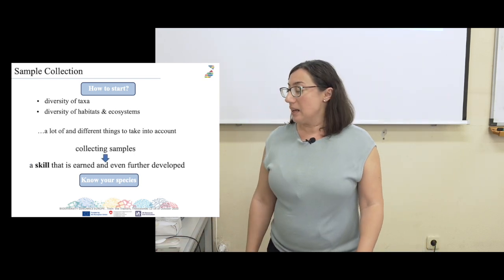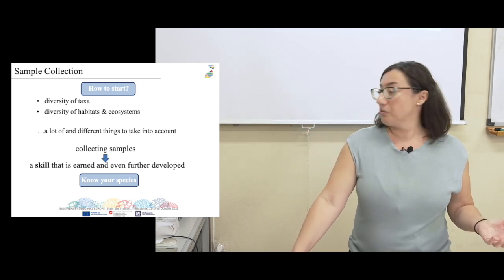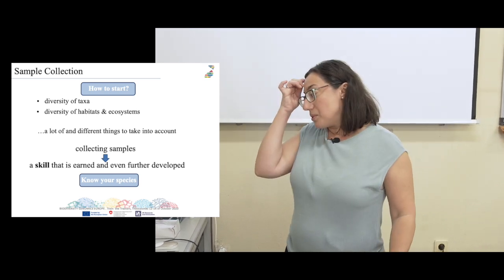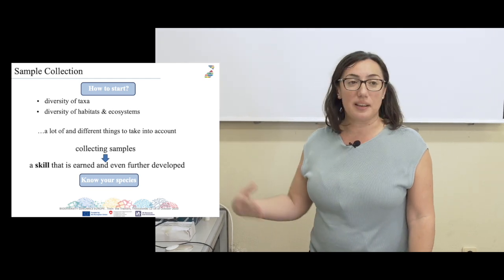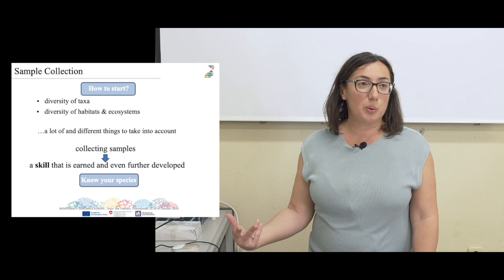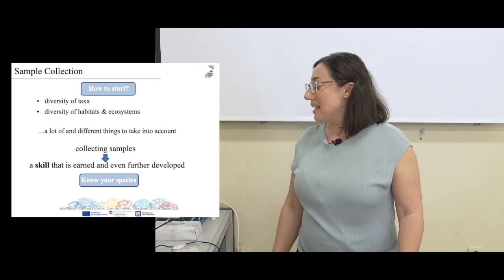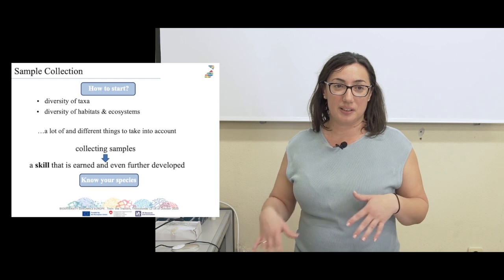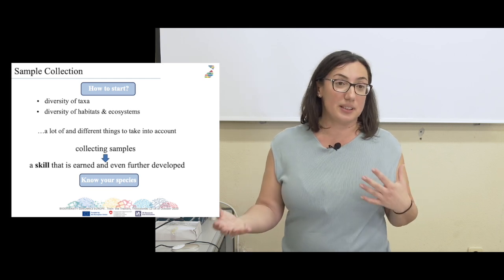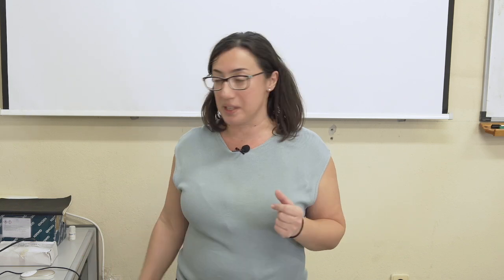And after being involved in several sampling campaigns, you earn a skill, which can get developed even further, a skill to sample a specific taxon or specific species.